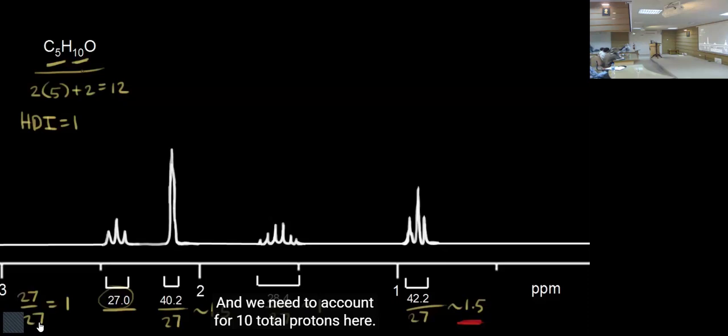And if, for example, the flavone has a sugar unit attached to it, then there is a chiral center. So there are many chiral centers. In this way, since most of us are natural product chemists, there must be at least one one-proton signal.